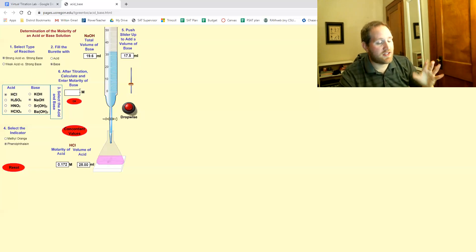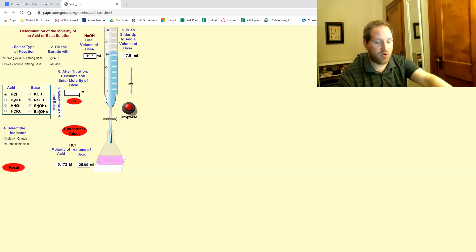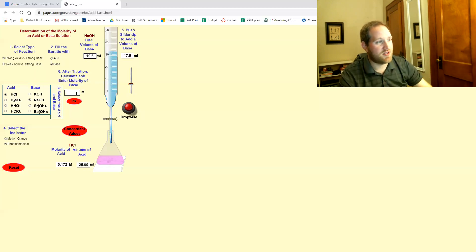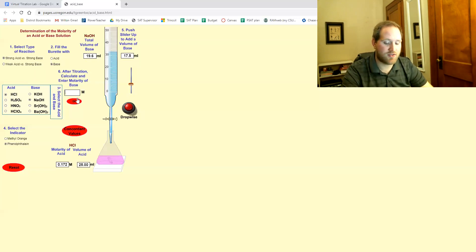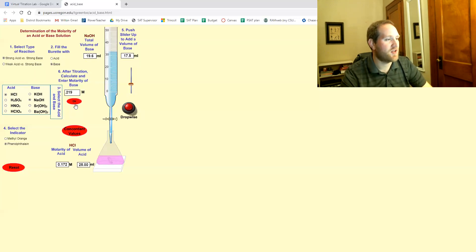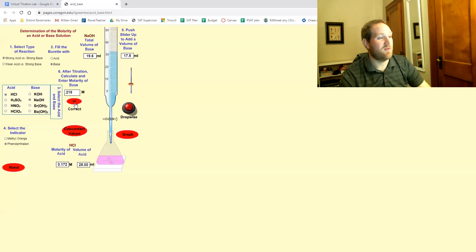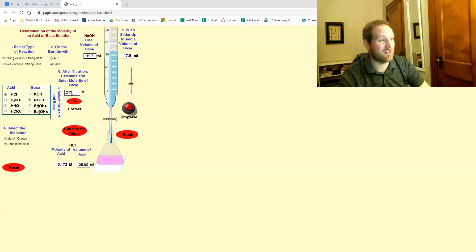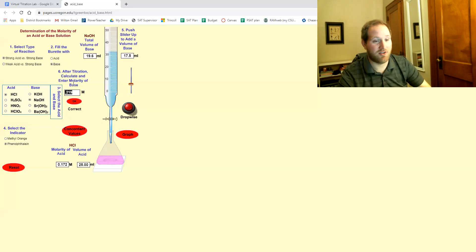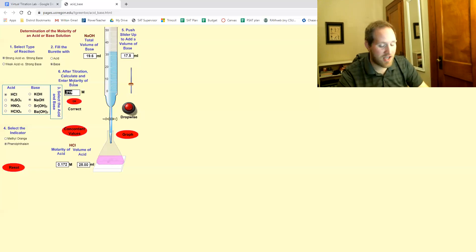Okay. So once you get your answer and once you put all the work in your document, you're going to test it. So I'm not going to do the work here, but let's imagine we go like 0.219. You hit okay. Okay. I swear it randomizes it. I literally just made this number up and it happened to work.